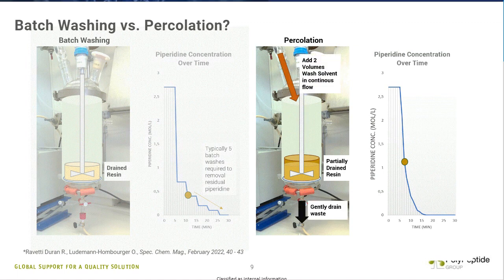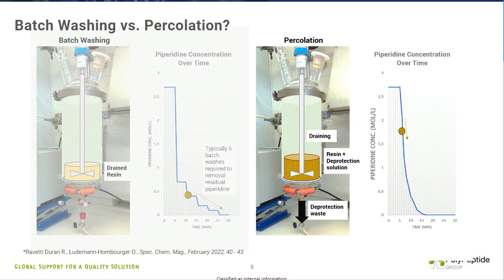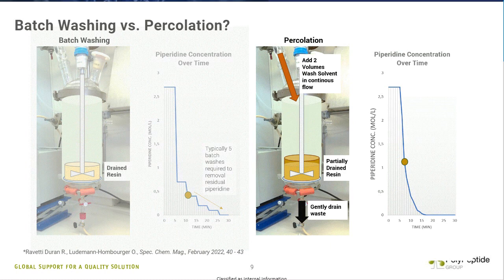Of course, we performed our synthesis at room temperature in both the demonstration and the GMP campaign. But indeed, this is something we're constantly monitoring because the temperature in summer or winter can have an impact in terms of coupling efficiency and lots of other things as well. So this is something we're constantly looking at.